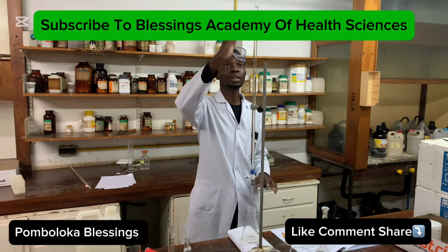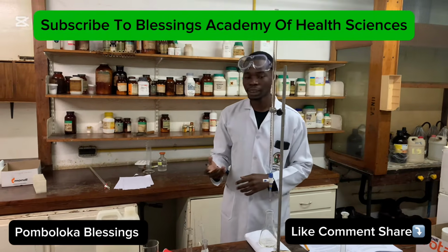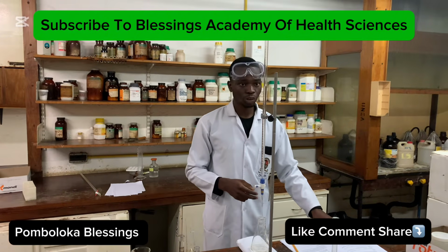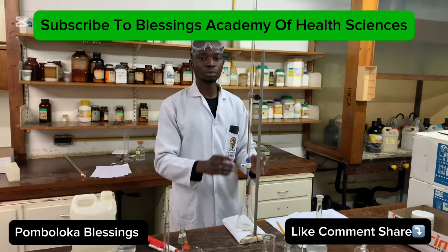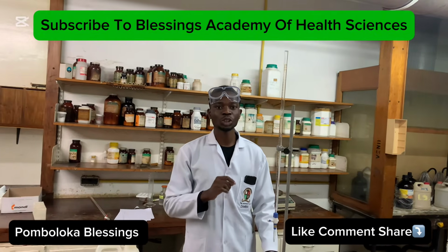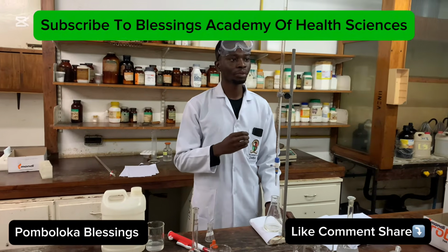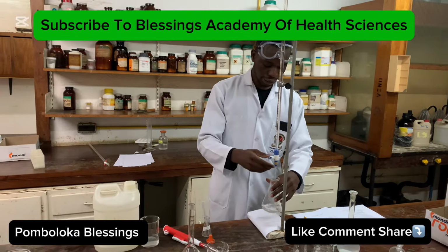We moved on from 0 there. We traveled to 16.8. If you want, you can refill up to 0 so that you can get the first part. But again, if you want, you can make the 16.8 your initial volume of the sodium hydroxide, and then you're going to record the final. So we are starting from 16.8. If you want, you can refill up to 0, then you start over again, making our initial volume of the sodium hydroxide 0. But for now, I'm going to consider 16.8 as my initial volume of the sodium hydroxide. So we can start titrating now.